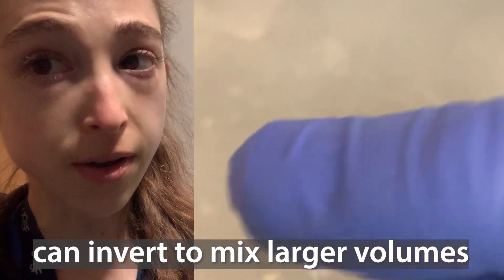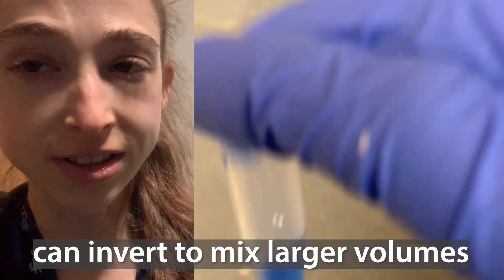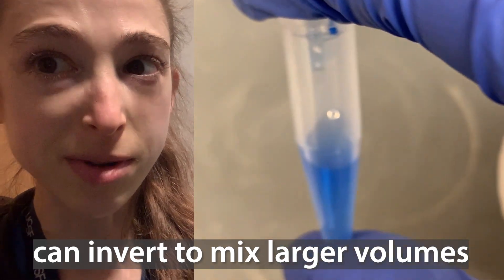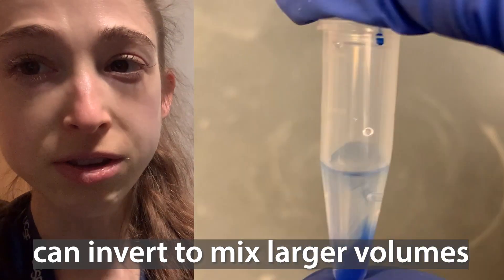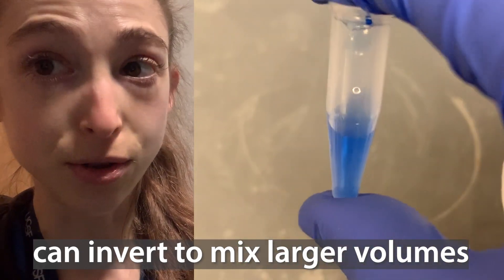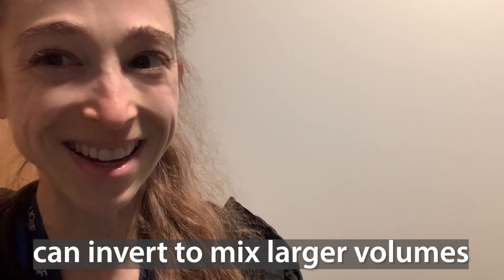If you have a large enough volume, you can also mix by inverting the tube. And if you have a lot of samples — maybe you're doing a mini prep in the beginning parts — you can have all the tubes in your rack and then invert the whole rack, making sure that you're holding on really, really tight.